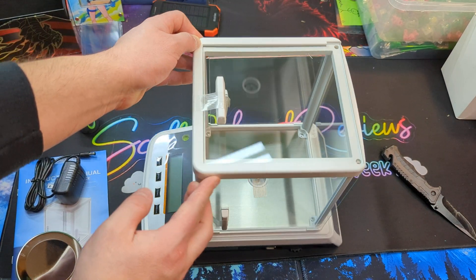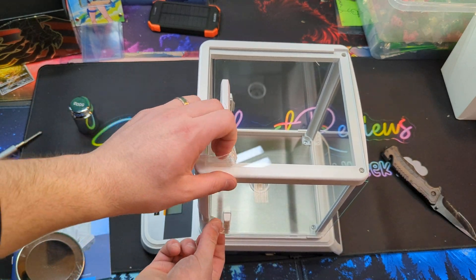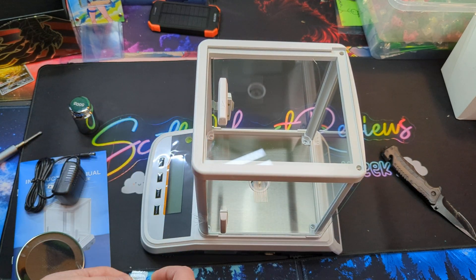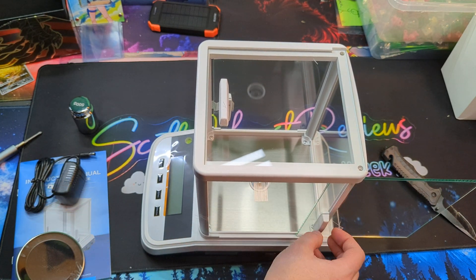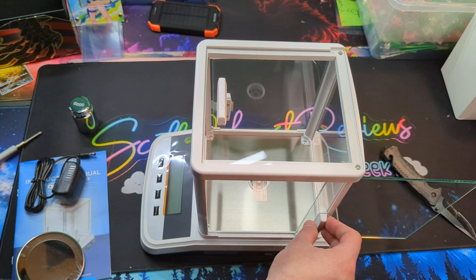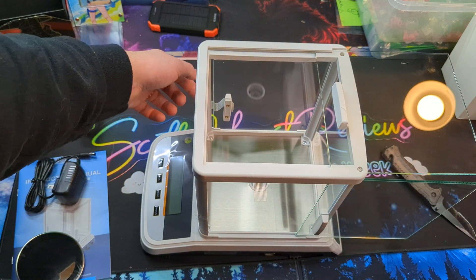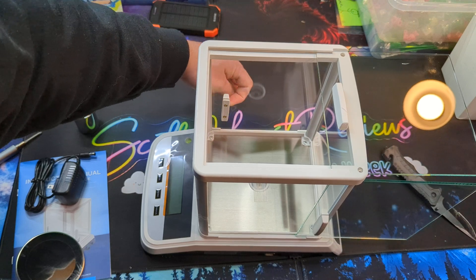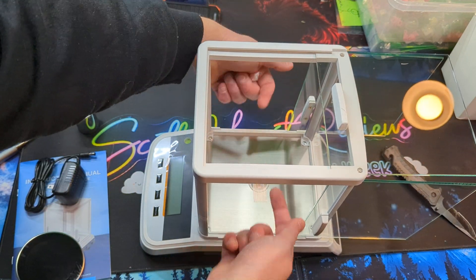For those wondering, this is glass. We're going to go ahead and take off all of the tape that protects it. As you can see, it slides very nicely — from the sides or from the top you can slide in, and on the other side it slides as well, so you can access it from all angles.